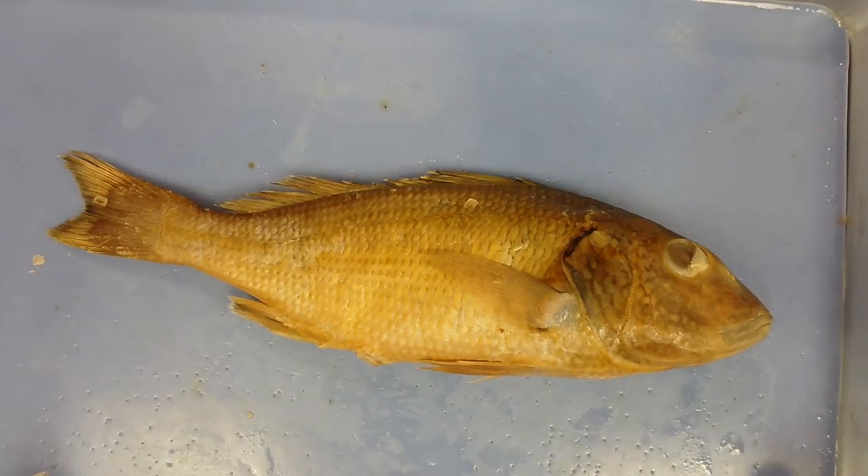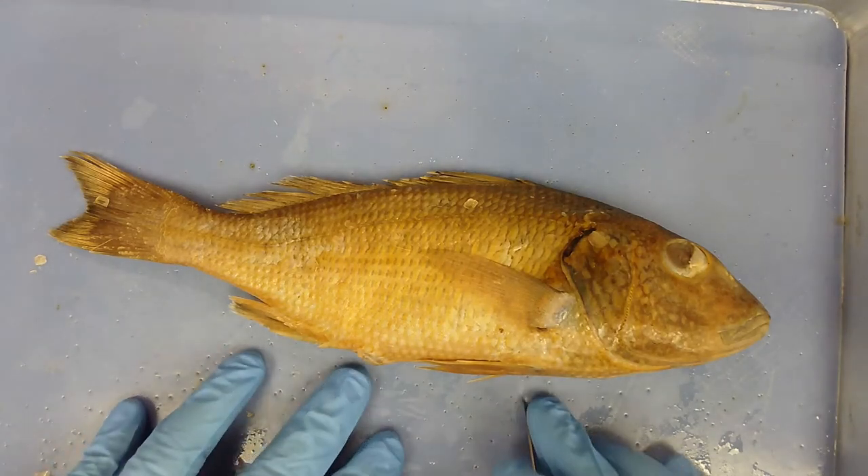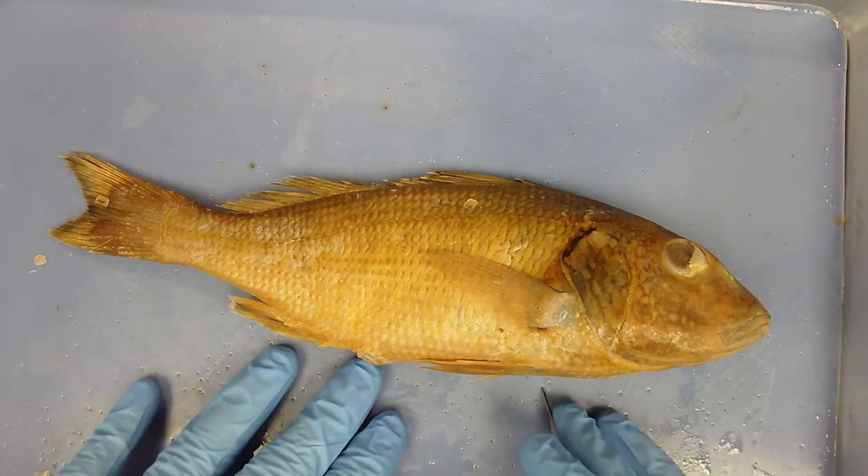This is our fish — our representative of the phylum Chordata, and more specifically the subphylum Vertebrata.